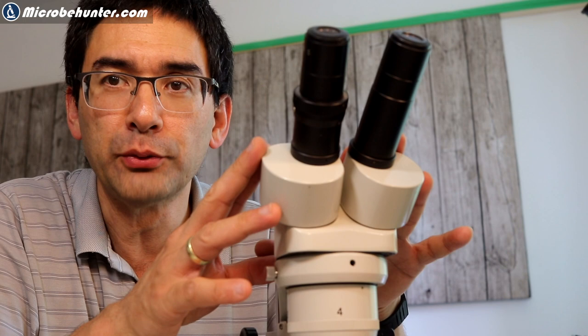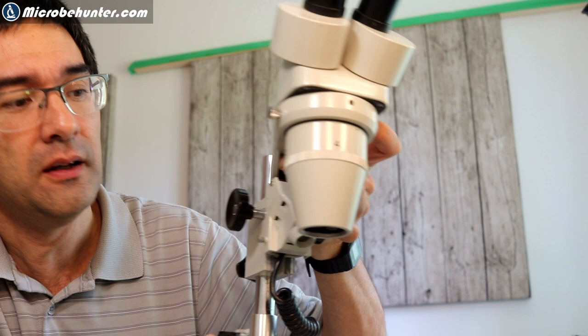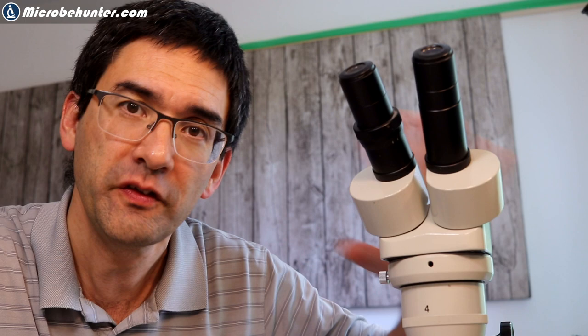Another important thing is that you get an upright image, because you want to be able to manipulate the object you're looking at. Regarding modularity or upgradability — I have to be very honest — this is pretty limited for stereo microscopes. There really isn't that much you can improve; they're functional out of the box. If you want spare parts or different eyepieces, or care about resale value, then brand could be a consideration.